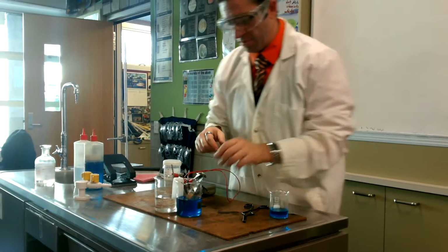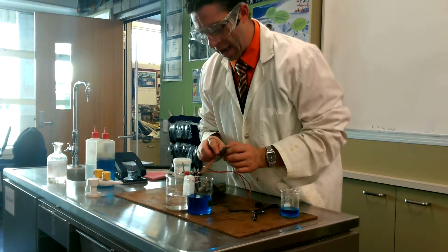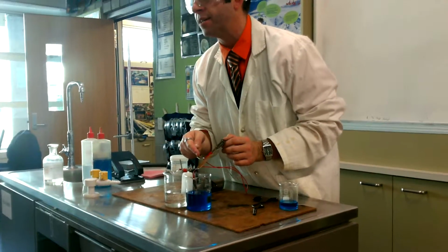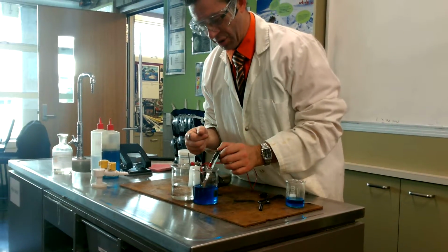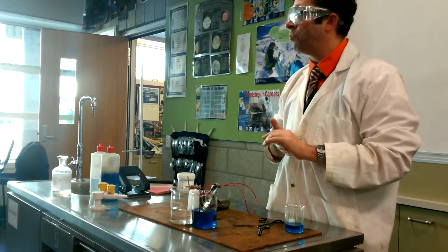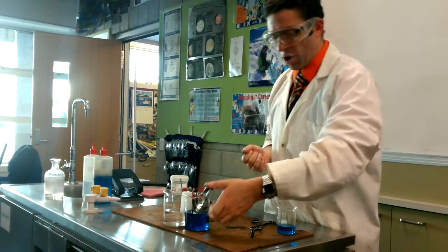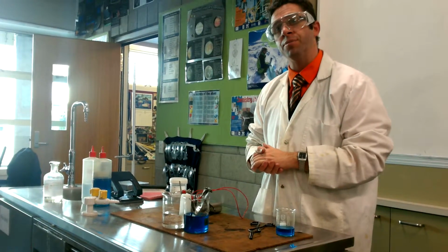And over here, we'd expect the copper to get fatter and fatter, and that's probably a bit harder to see, but it looks a lot cleaner, doesn't it, than it does up the top. So that would suggest that there's a layer of pure copper being formed on the outside of that. And that's exactly what's happening there. So reduction, these copper ions are turning into copper metal.